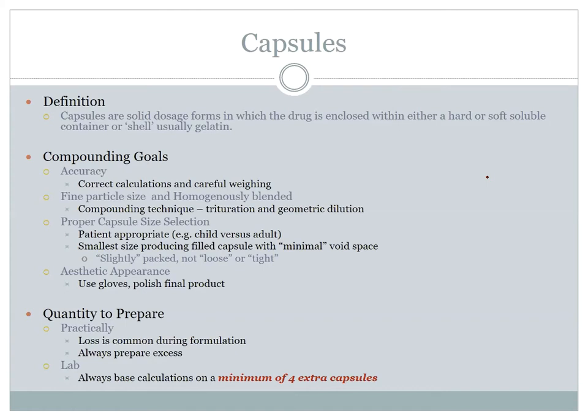All right. Third is capsule size selection. Normally when you compound a capsule prescription, the prescriber does not indicate what size of capsule to use. That's kind of the art form that the pharmacist chooses. So hopefully from watching the podcast, you realize there's a variety of different sizes, right? So let me ask you this. Let's say I was going to give you guys, say, a happy pill.